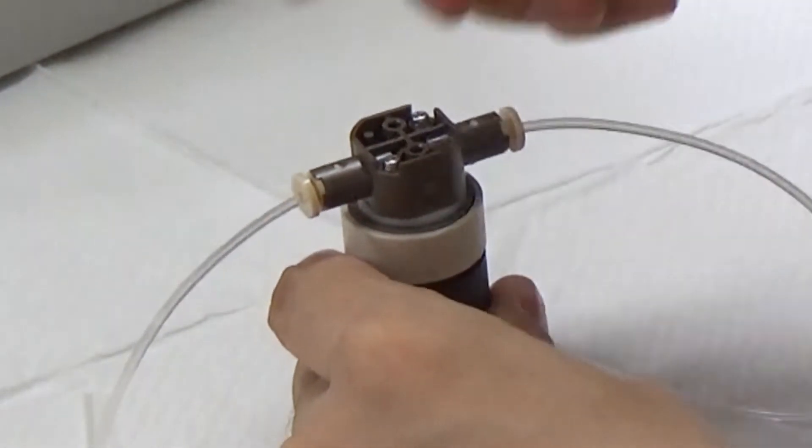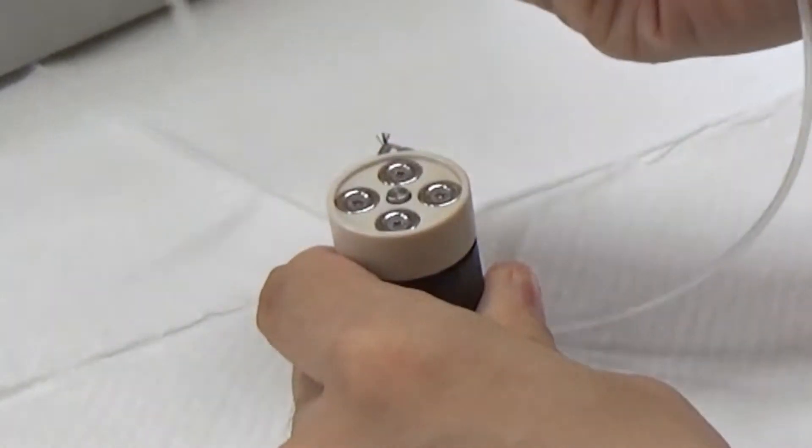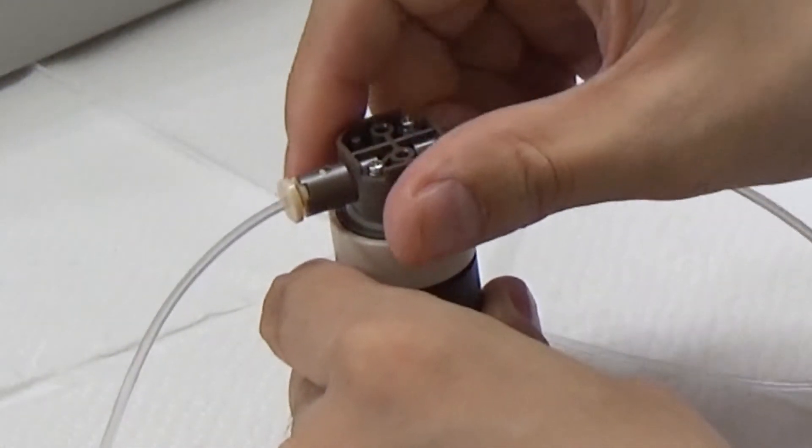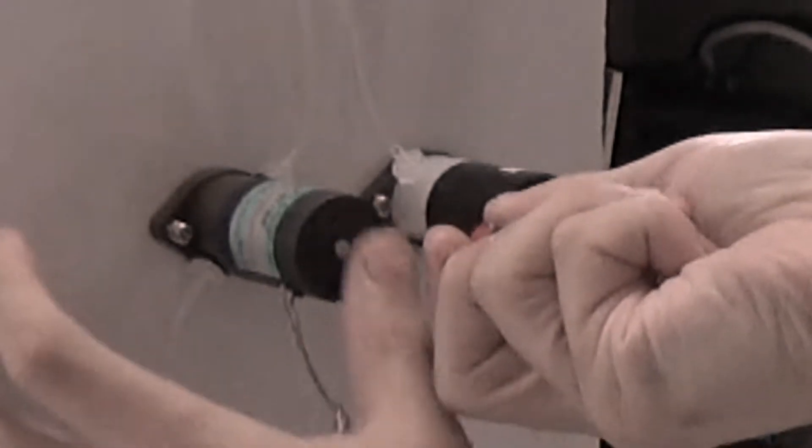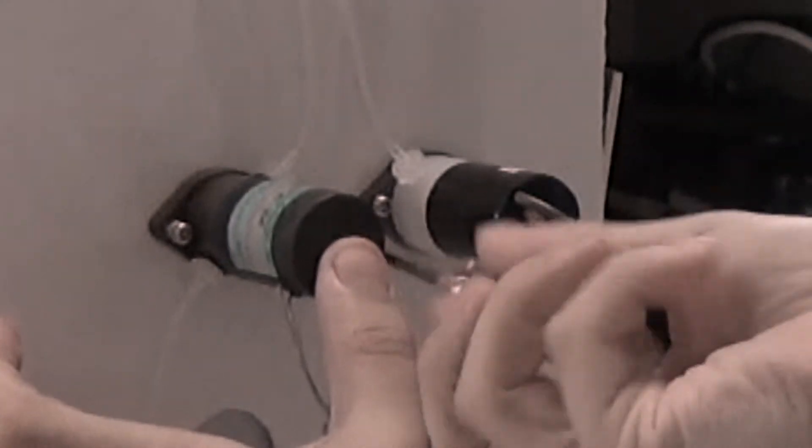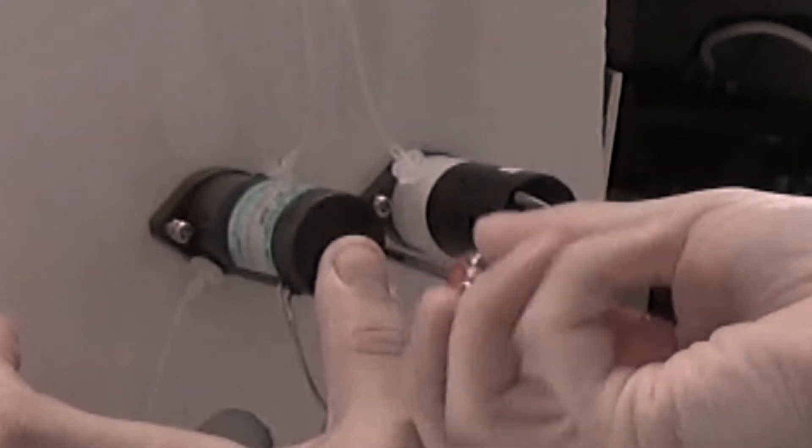Have you ever wanted to replace the wetted materials for each test or experiment? Typical valves have the wetted parts and the actuator integrated, and the only way to replace the wetted part was to replace the entire valve.